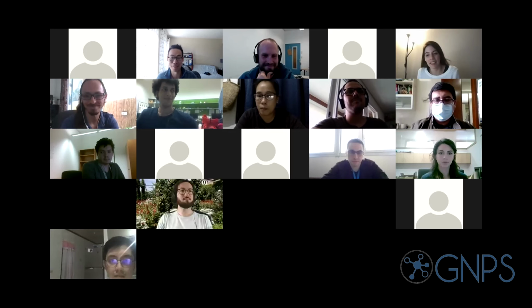Hopefully it's useful. At least it's been useful for me and Danny to look at each other's data. He runs something for an hour off the instrument, and he's like, Ming, check what I did today. And I was like, oh, that's cool. So at least it's one way to pat your lab mates on the back at a very minimum.